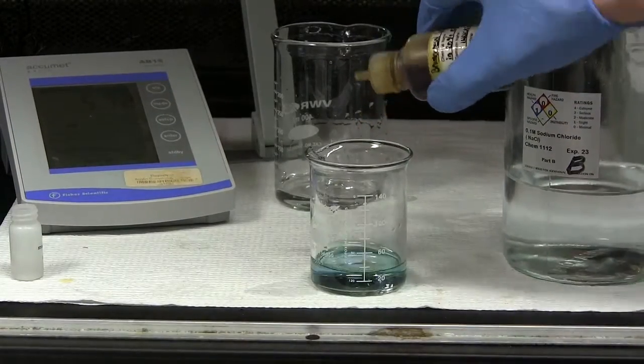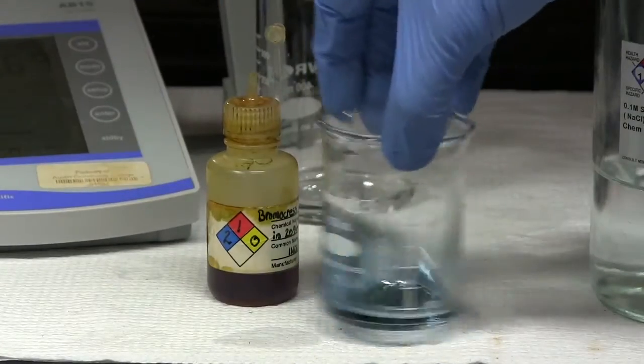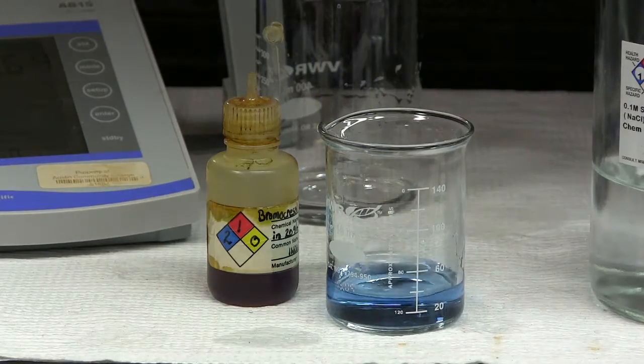After you have completed the measurement, add a drop or two of bromocresol green to the solution and record the color you obtain.